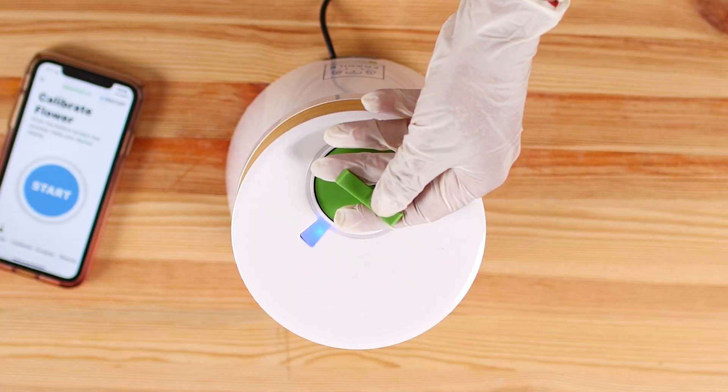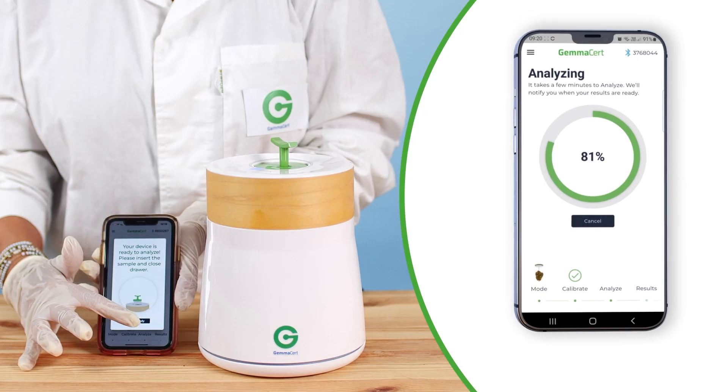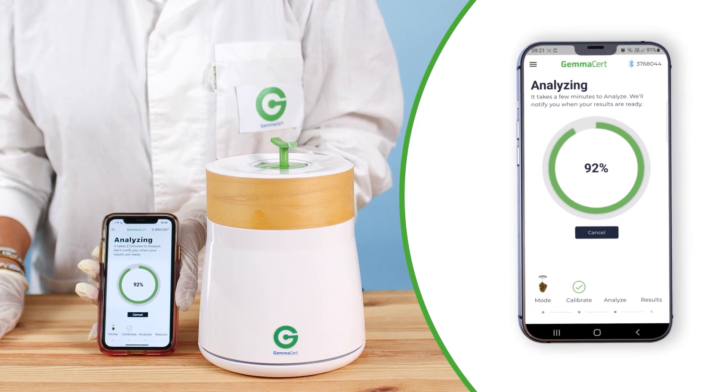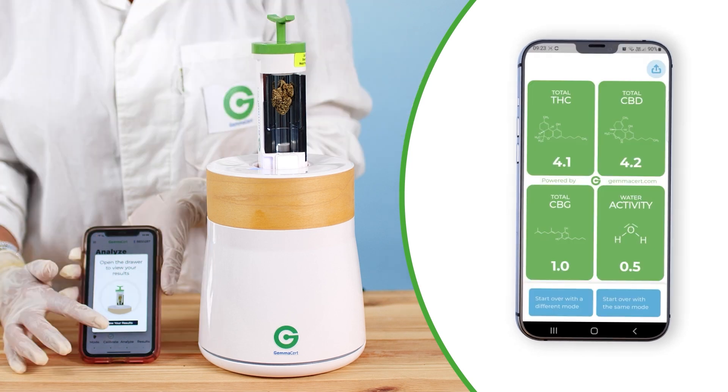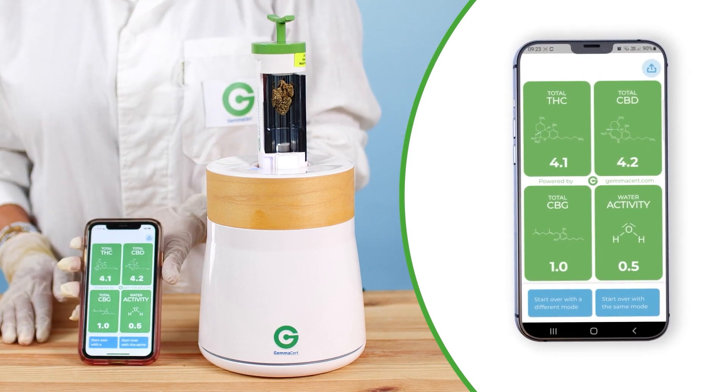Drive the drawer down gently using the green handle. Press Analyze on your application to start the analysis. When complete, the app will notify you to pull the drawer up. Choose Results to display your results.